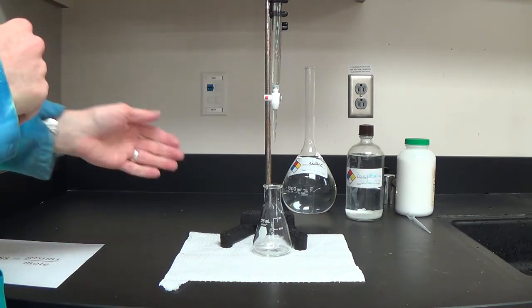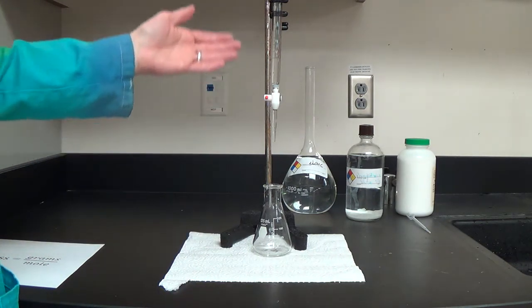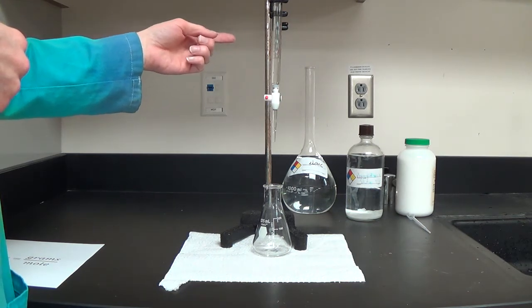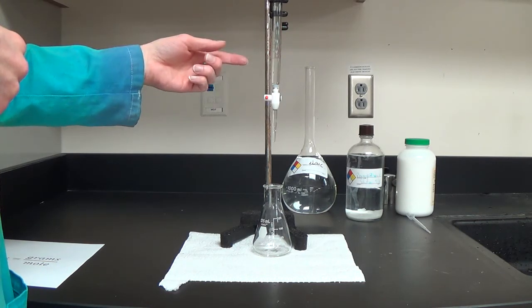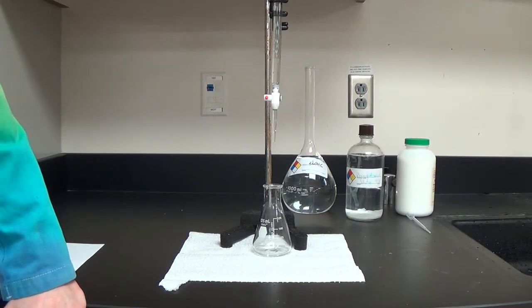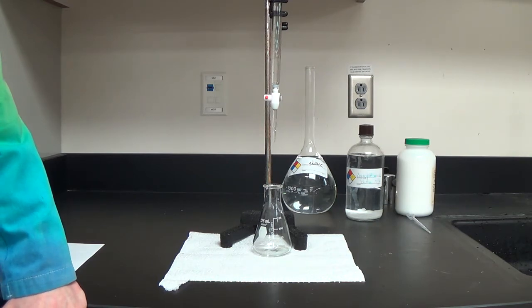The goal of a titration is to determine something of an unknown, which will be in my flask, by titrating it with a known. Knowing all the information about my titrant in the burette, I'll be able to calculate my unknown. In this particular version we're doing in class, we're going to be looking for the molar mass of an unknown acid.